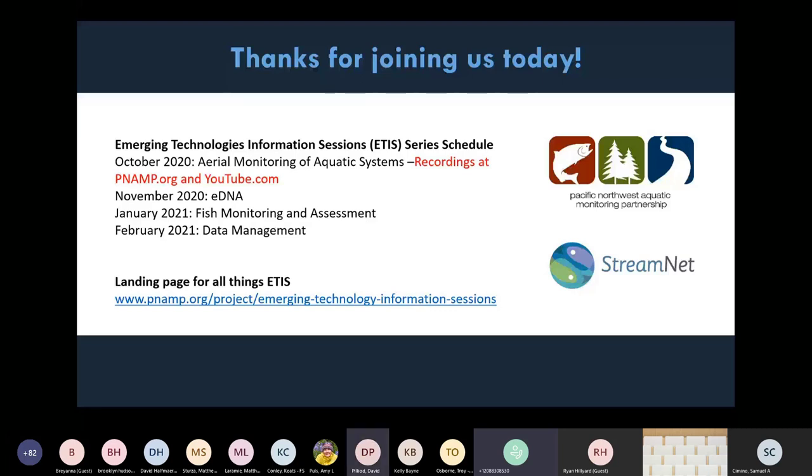But if you're setting out to develop a monitoring strategy that's going to be more than just a one-off, a little bit of pilot work up front to test this goes a long way. Make sure you understand your detection probability, based on the volume you're expecting to get. That goes a long way just to ensuring that your survey is going to be adequate for your question.